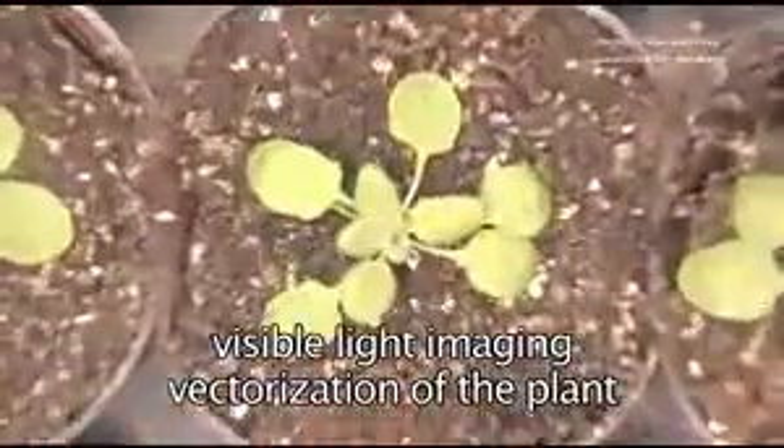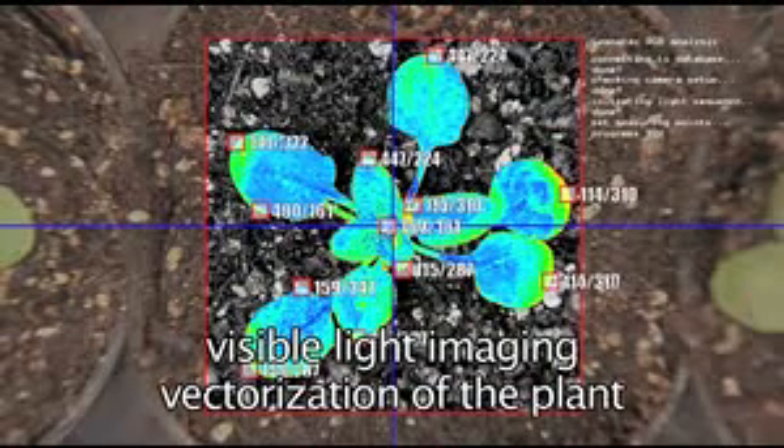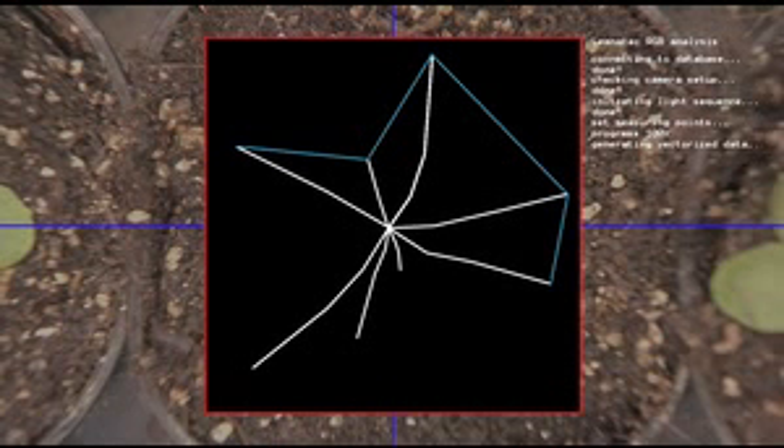Visible light images are analyzed by the Lemnatec image processing software to vectorize the test organisms and provide all visible parameters such as size, shape, color, area, mobility, or number of detected objects.